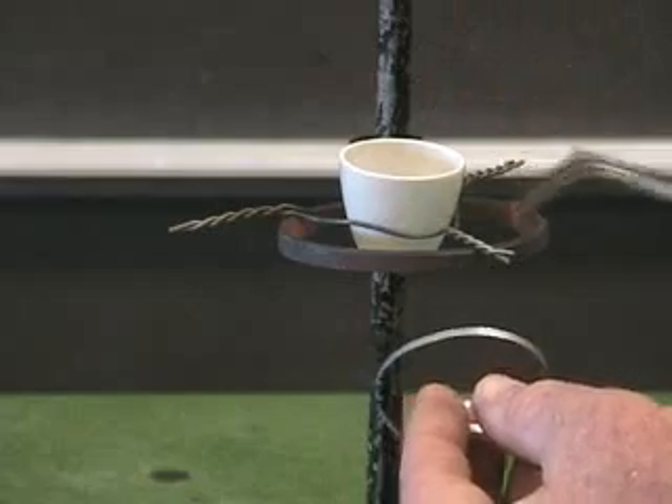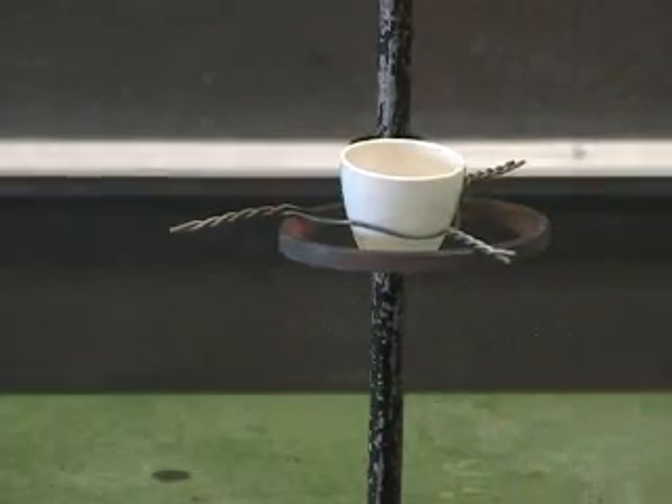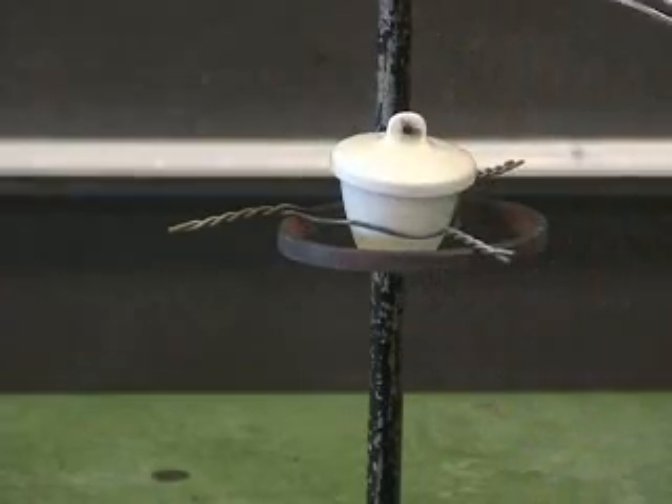Let's begin the experiment of burning the magnesium inside the crucible with it covered. This is a crucible cover. It goes on here like this with the metal inside.